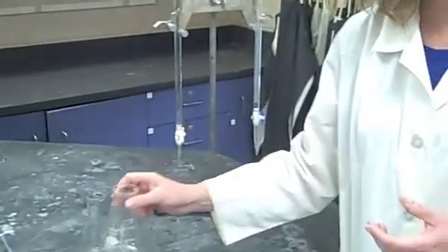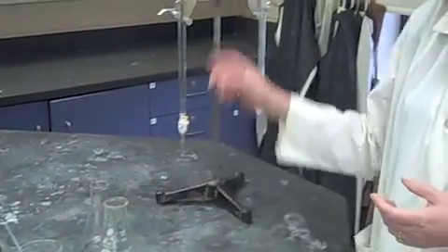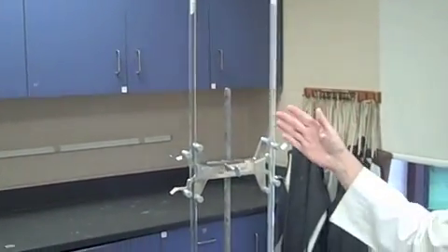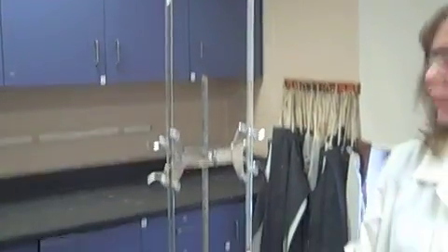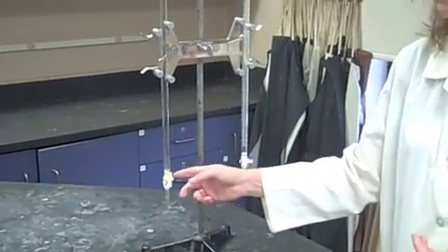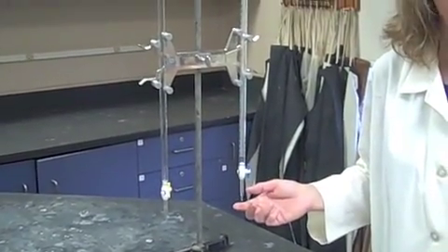At least two Erlenmeyer flasks, a burette for the acid and a burette for the base. I like to use a color coded one, but when you're actually in the competition you don't know if they're going to have them color coded for you.